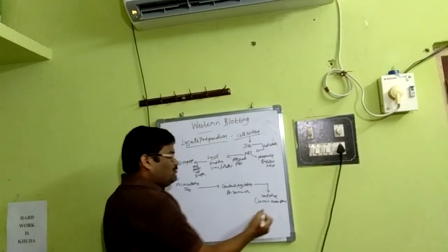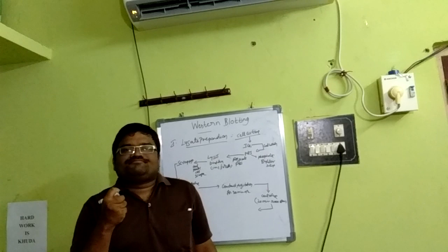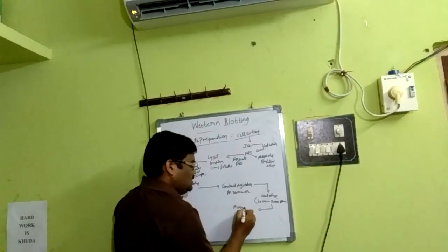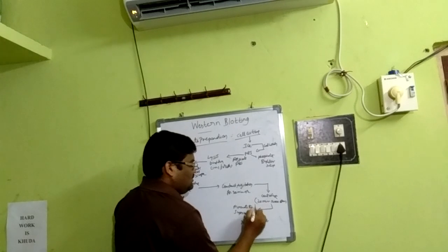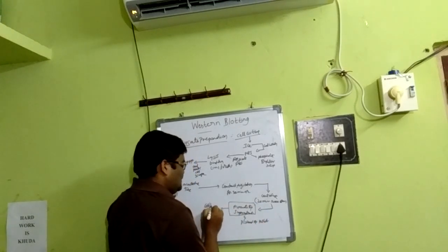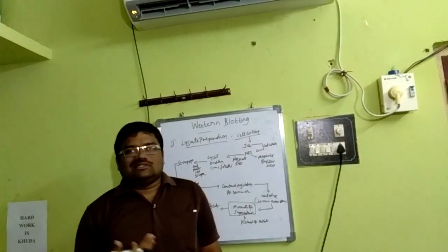Okay. After centrifuge, we have to aspirate the supernatant and discard the pellets. This is very important. This is called cell lysate. This is an overview of how the thing should end.